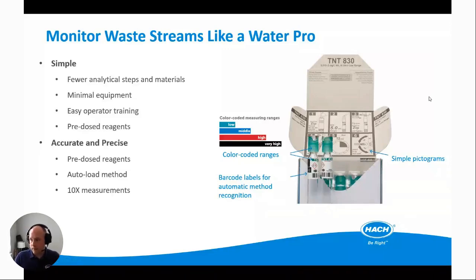If you look here at the vial, there are a couple barcodes on the label on each one of these vials. And as the vial is inserted into the instrument, the method is auto-loaded, and so there's no interface with the instrument that would lead to running maybe the incorrect method.